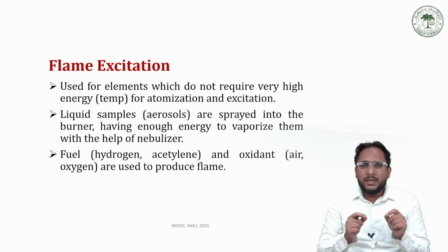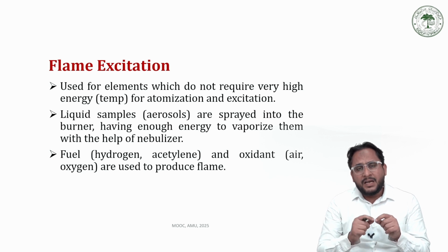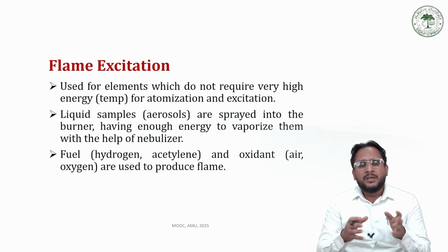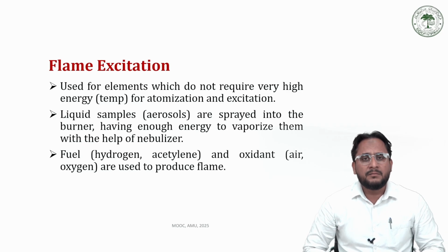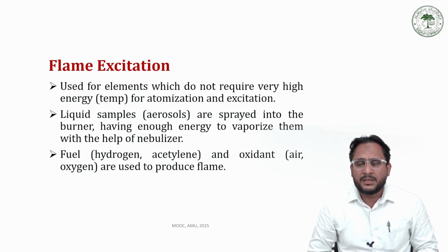So we use flame excitation for metals that can be vaporized as well as excited easily, in the limited temperature range up to 2000 or 3000 degrees centigrade.